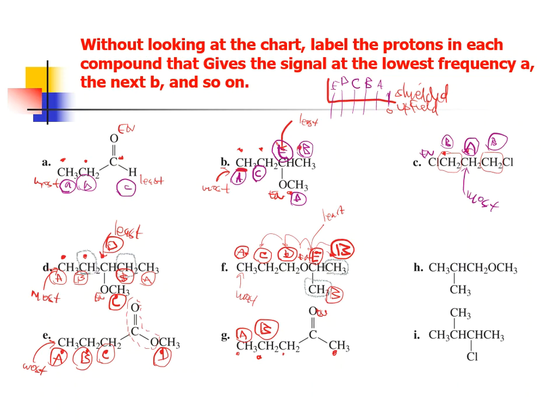So what I would see is that this carbon has 3 hydrogens that it has to fight against. The electron cloud would be more on this side than that side because carbon can't put up a fight with 3 hydrogens as well as it can with 2. So that means that this CH3 group on this side would be the next in line. This will be the C, and this will be our D mark.